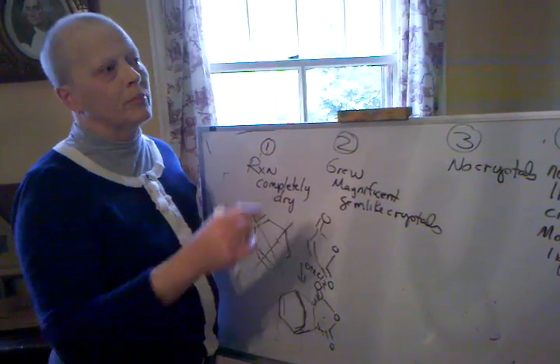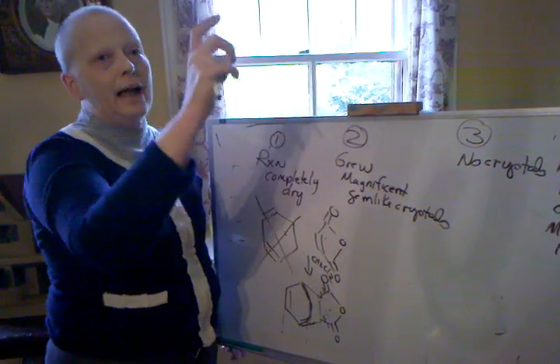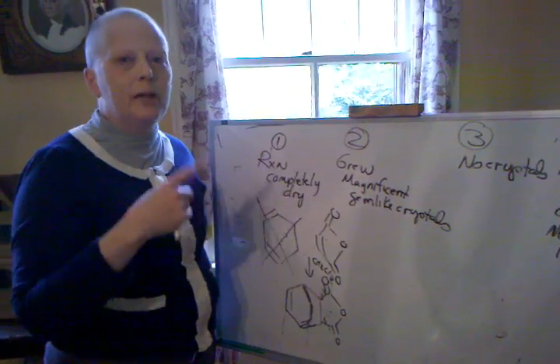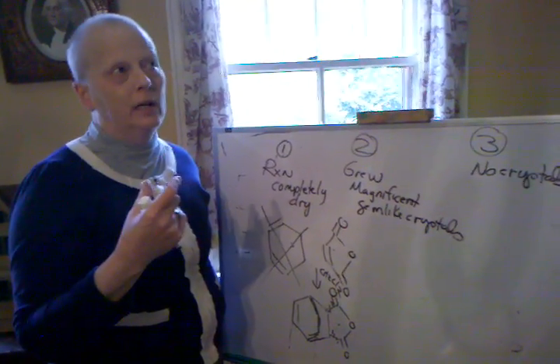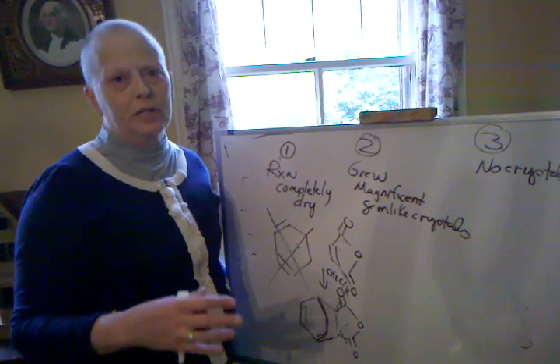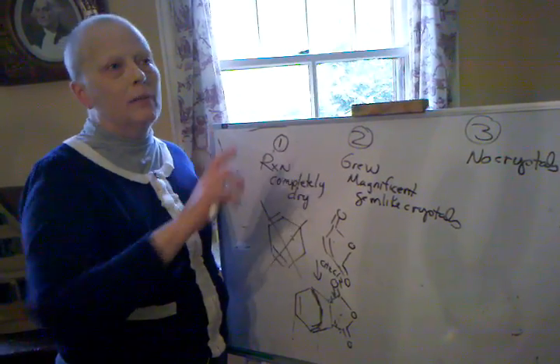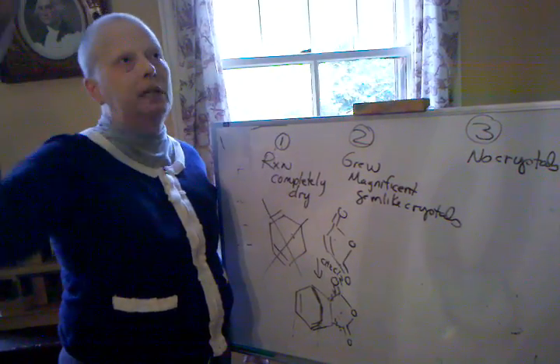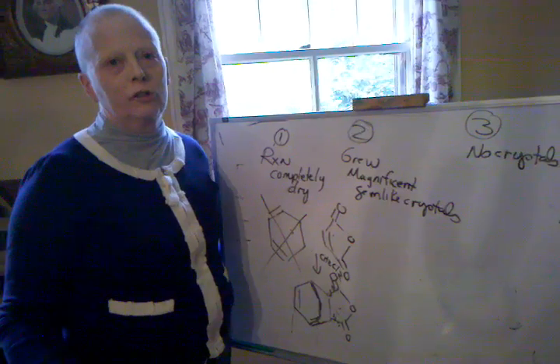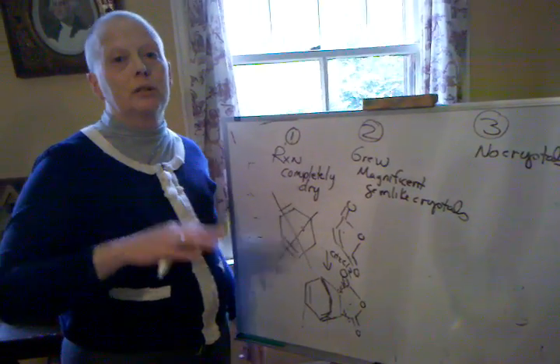In other words, individual molecules can aggregate in such a way that it's so ordered that you actually get a geometric shape that you recognize on a macroscopic level. Like they can form prismatic shapes and things like that, which shows the geometry of the molecules can be transmitted into a macroscopic structure, which I think is amazing. And again, that's showing the molecules communicate with each other.